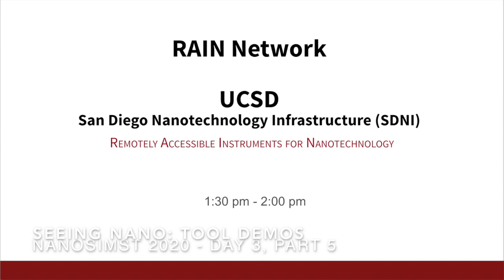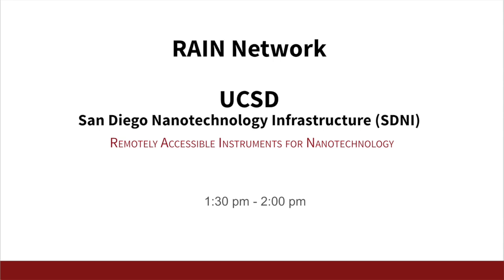But anyway, we have some people coming to show you and give you an example of what we can do remotely. That's one thing. And then the second thing is to showcase how we can look at objects at a really small scale. Yeah, so I'm Dr. Ryan Nickel. I'm an electron microscopy manager down here at UC San Diego.